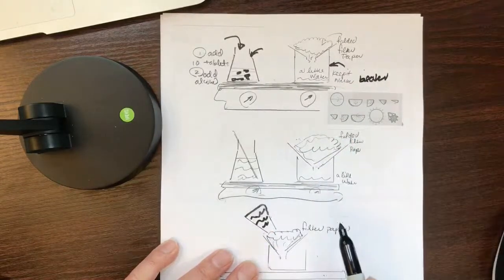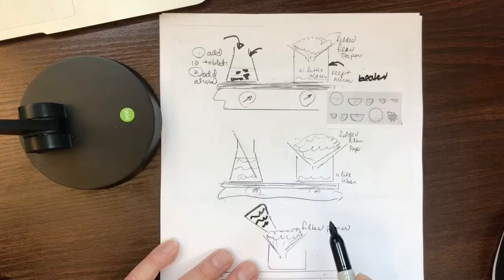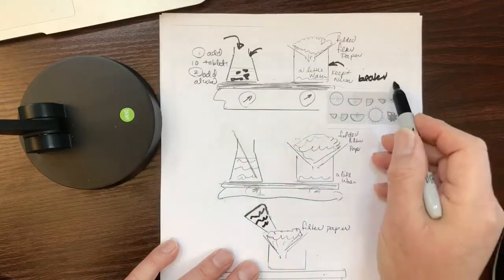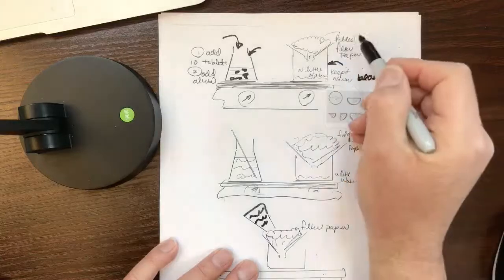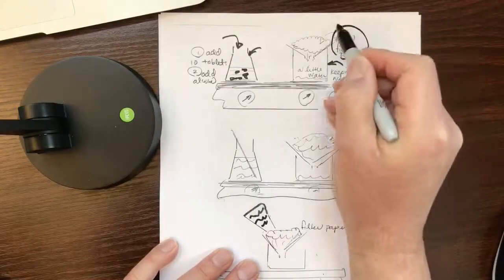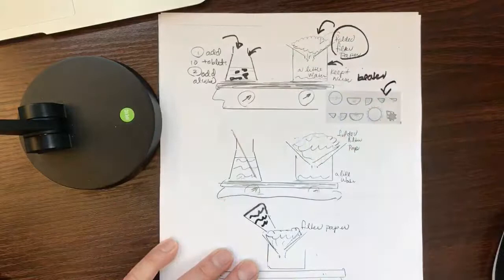We fold a filter paper. I'm not a very good drawer, so I have a little instruction here. I'll bring something tomorrow. This filter paper here is folded, and that's going to help us filter the starch and filler away from the aspirin.